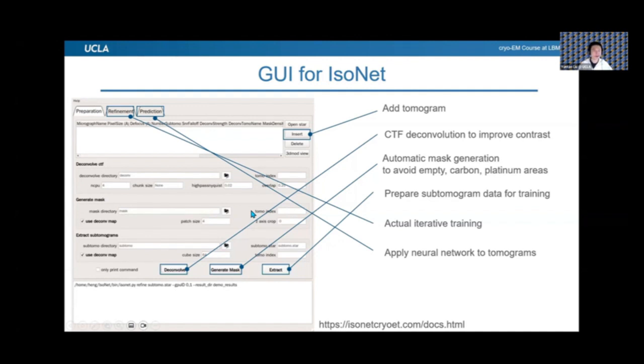If you don't like it, you can take the mask out and use your volume eraser to erase anything on the mask, and then load it. If you scroll here, you can actually input your own mask, and then you can use your own mask for the training.